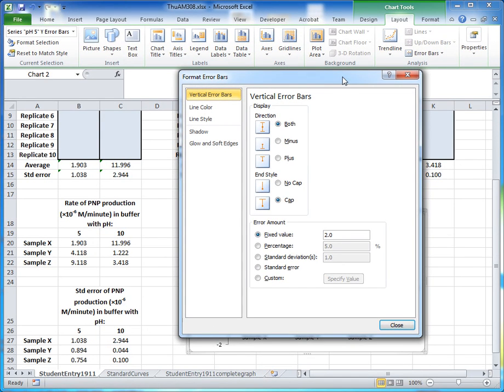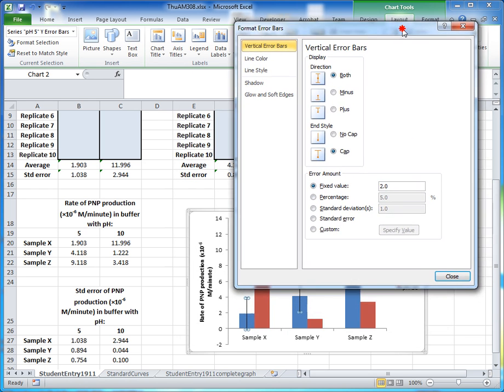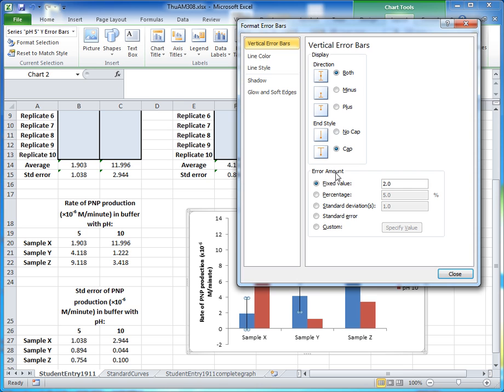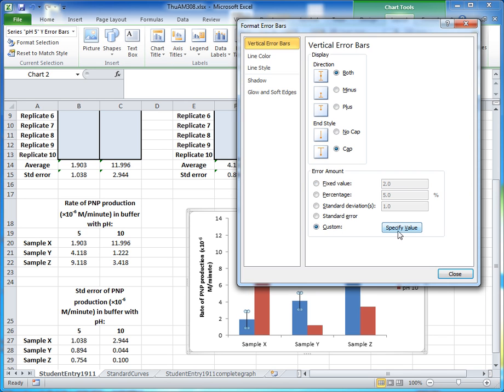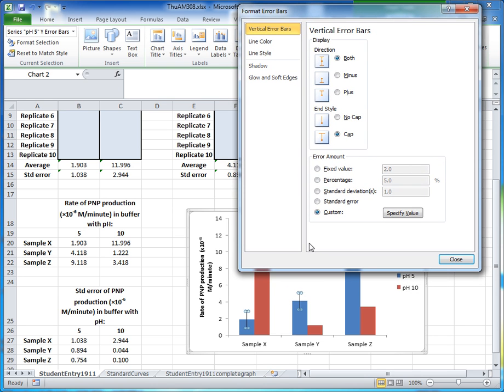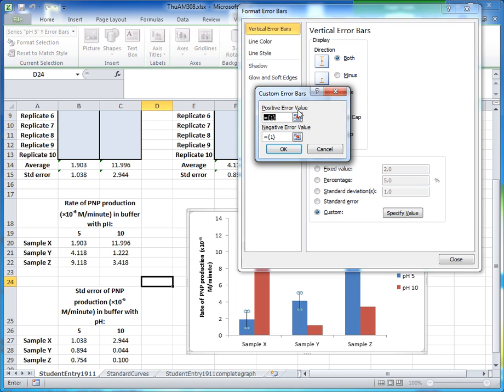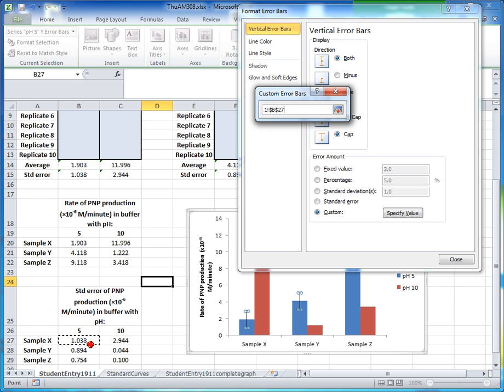Excel isn't reliable at calculating error bars automatically, so it's always best to specify custom values. Under Error Amount, select the Custom option, then click 'Specify Value'. Excel has already plotted some default error bars, but we want specific values. For the positive error value, clear the box, then come back to the spreadsheet and select the standard error values for the pH 5 series.